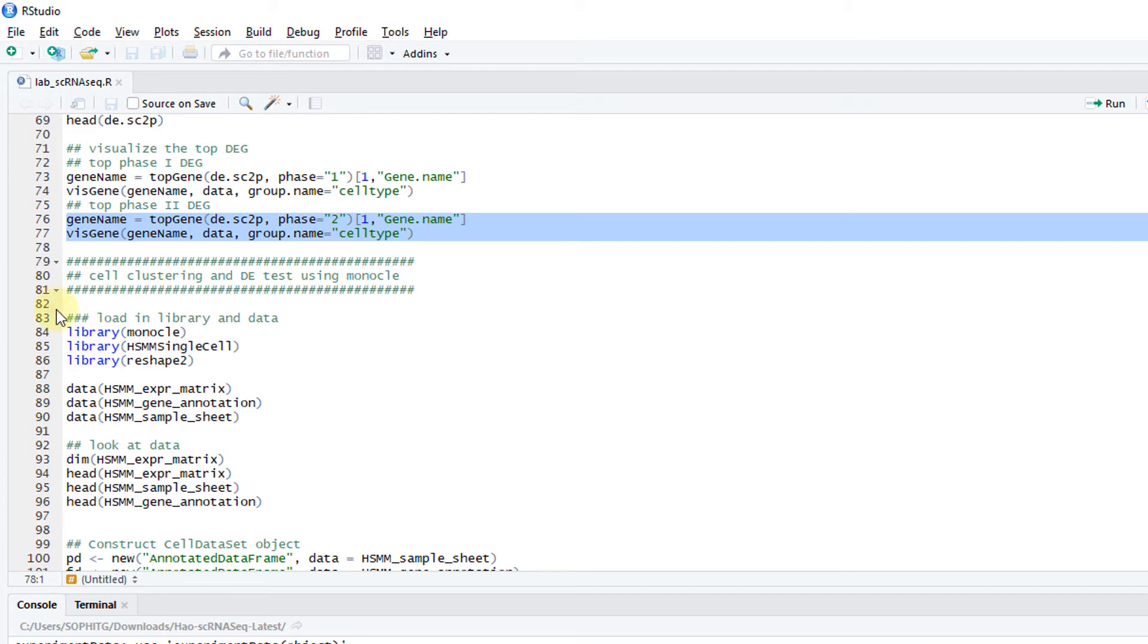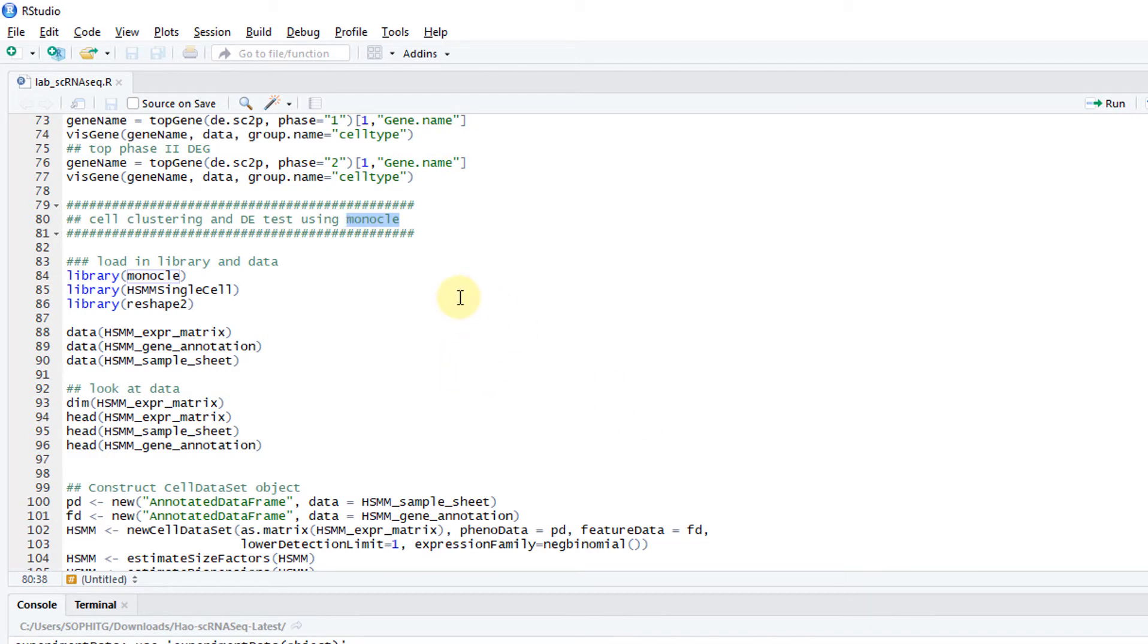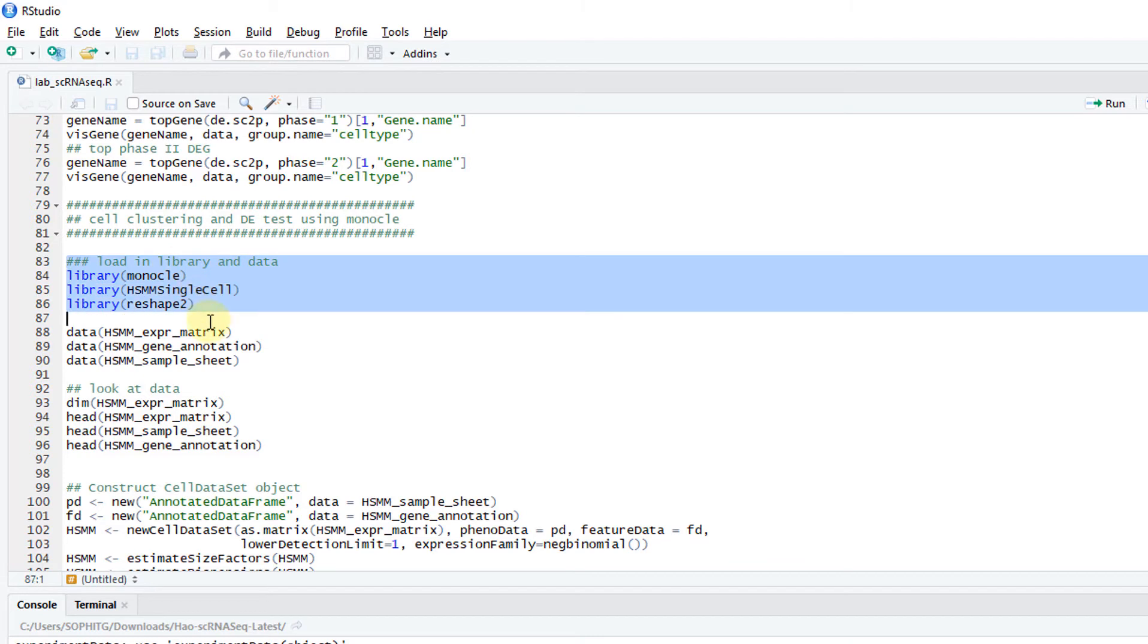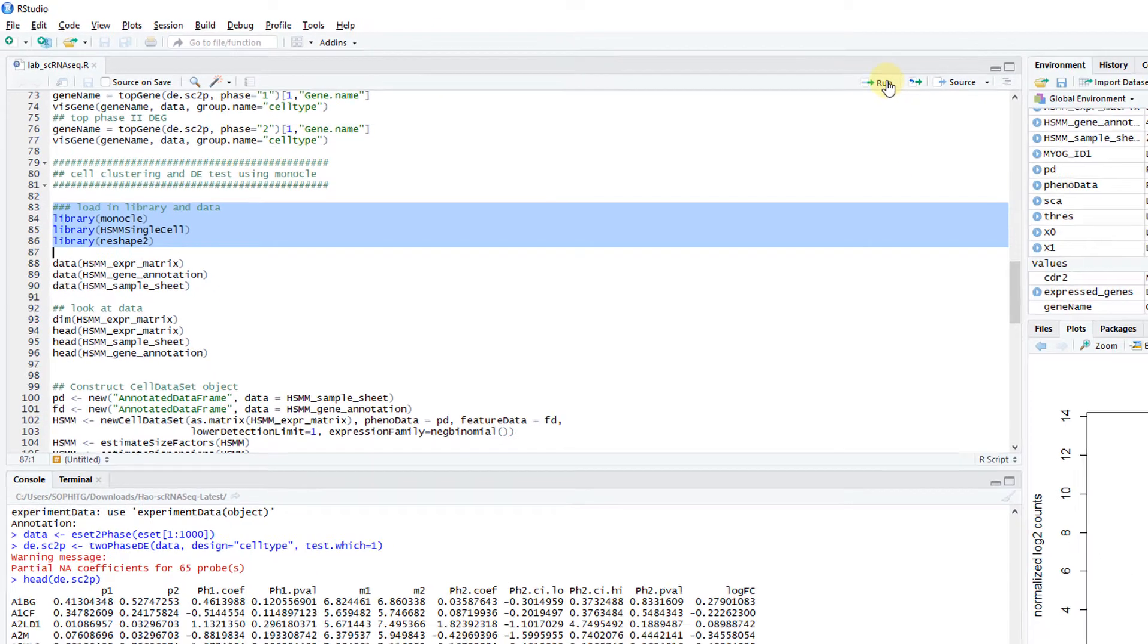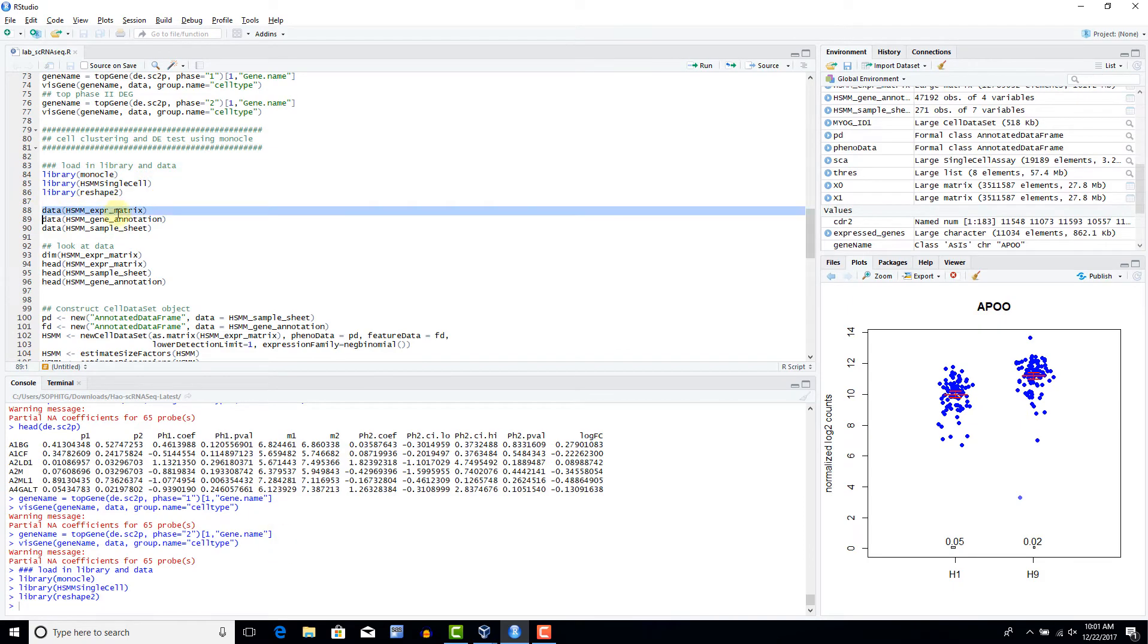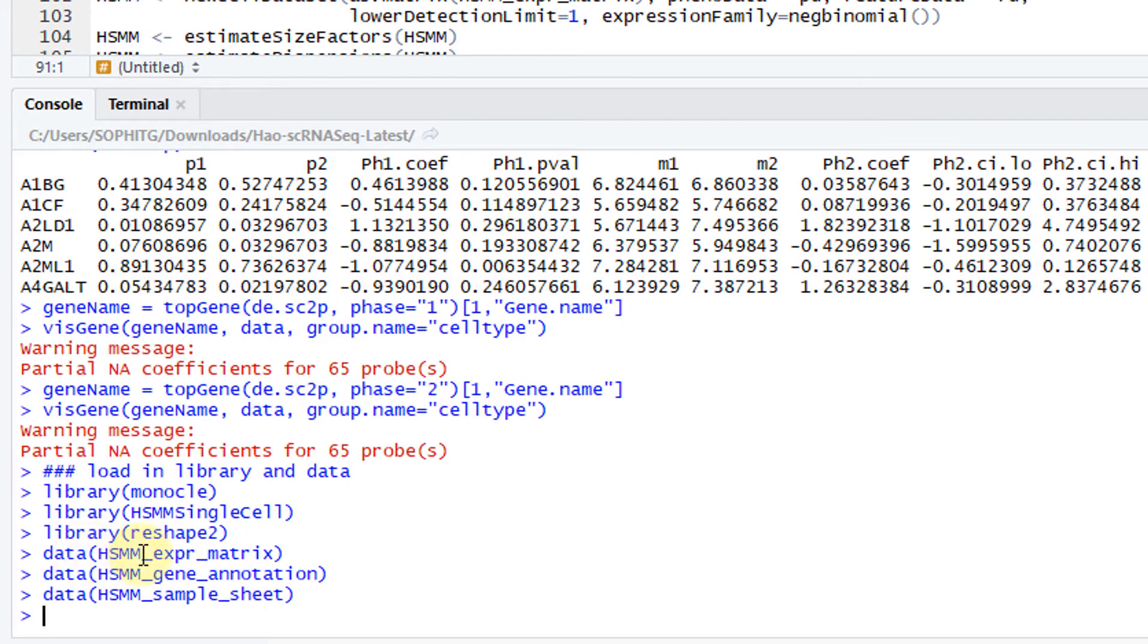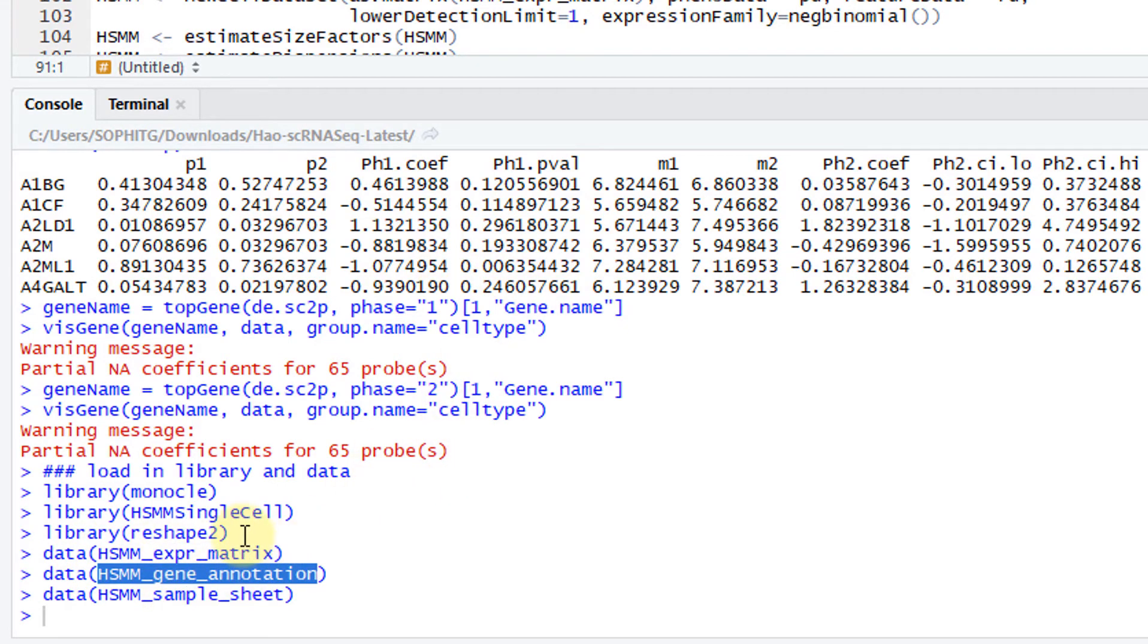Let's try some cell clustering and differential expression test using Monocle. Monocle is a software. It's pretty popular. It's on Bioconductor. I will first load in the Monocle library and an example dataset that comes with Monocle. It's the HSMM dataset. Let's load them in. Take a look at it. Then load in this data.